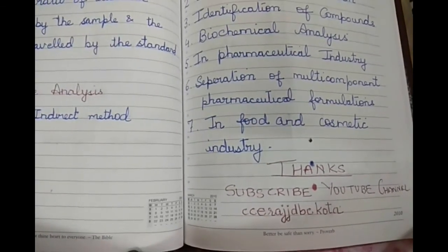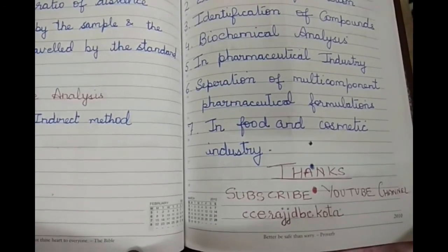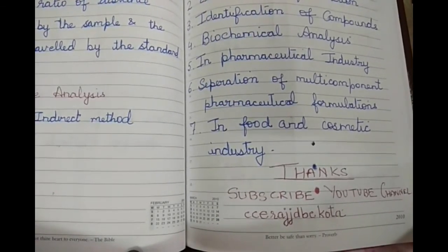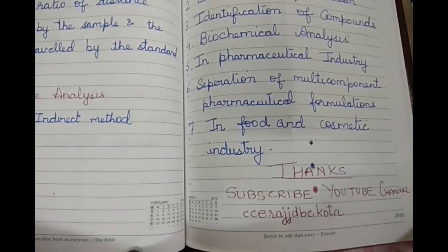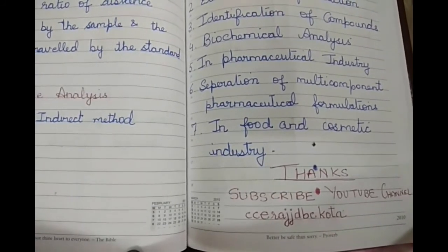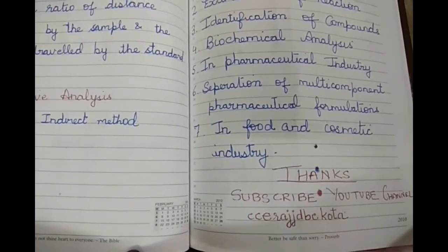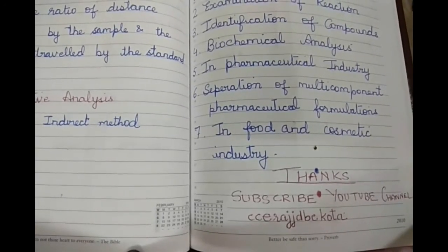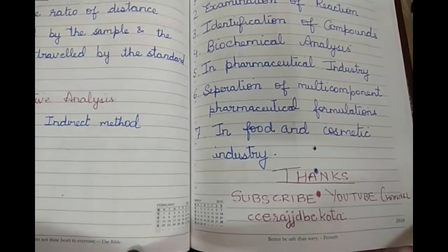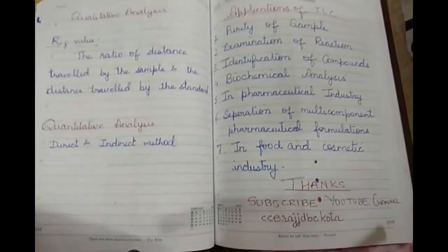So this was an outline of thin layer chromatography technique. This is just a complete outline involving the principle, instrumentation, method, and the applications of TLC.